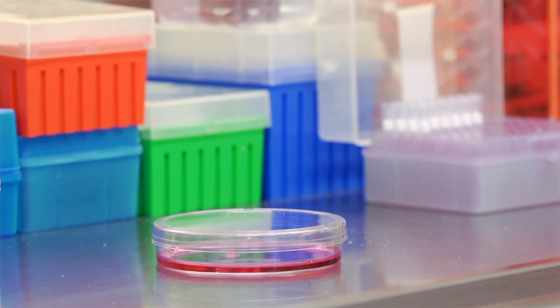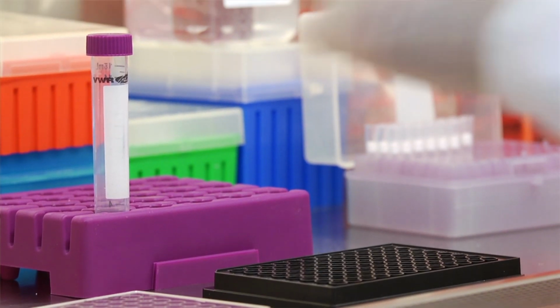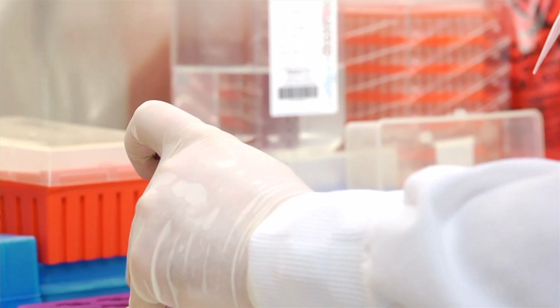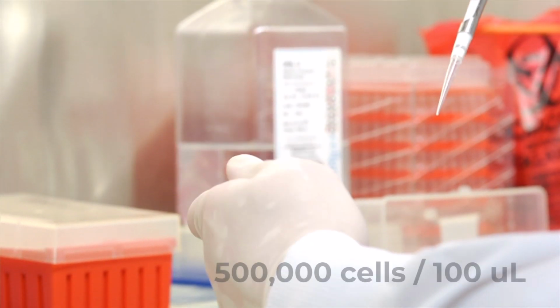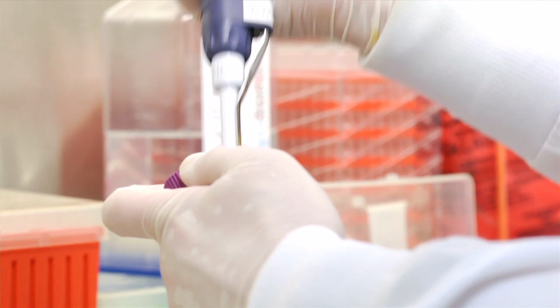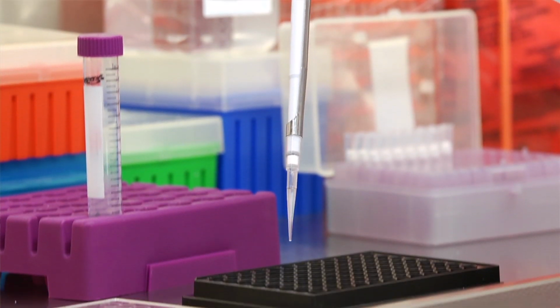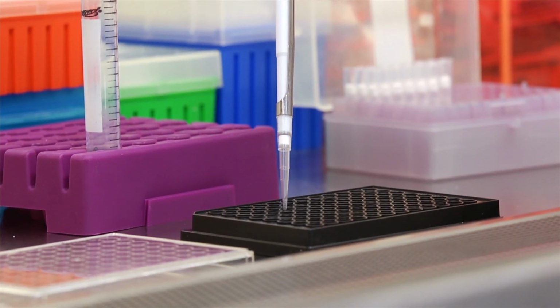The next day we wash the cells with PBS, trypsinize, spin them down, and resuspend the cells to a desirable concentration. In our example, the cells are maintained at a concentration of 500,000 cells per 100 microliters. The cells are then added to multiple wells of a black 96 well plate for imaging. We will store the cells in an incubator as we set up our software for imaging the plates.